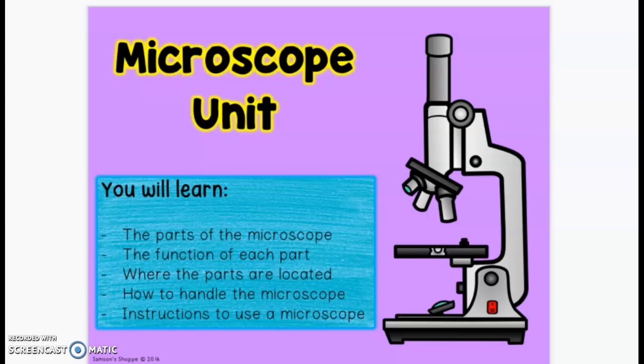Okay, you're going to have 2 days to complete this slide deck, and it's basically a hyperdoc on microscopes. So you're going to be learning the parts of the microscope, the function of each part, where the parts are located, how to handle the microscope, and instructions on how to use a microscope.